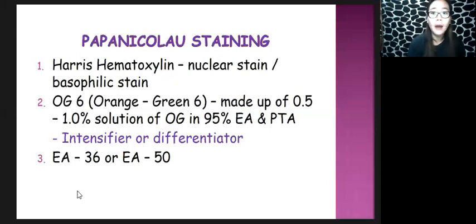They do not come from your paraffin blocks. And so there is no need for you to include xylene at the start of your Papanicolaou staining. Xylene is only utilized at the last part of your Papanicolaou staining, and its function is the same as in your H&E, which is for clearing purposes and to make your smear compatible with the mountant that you are going to utilize during cover slipping.